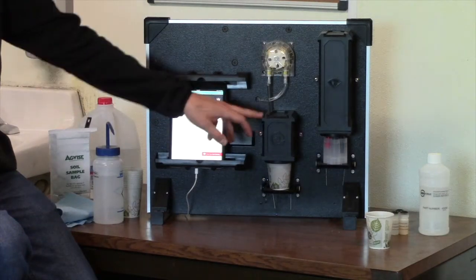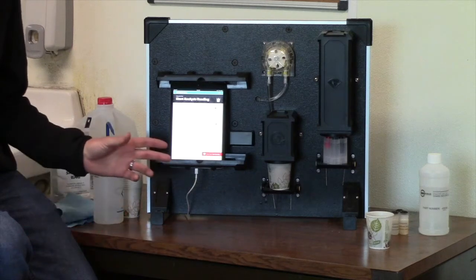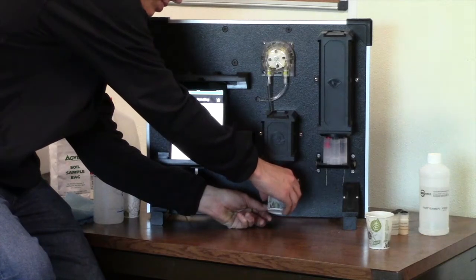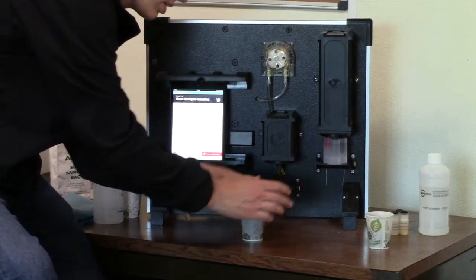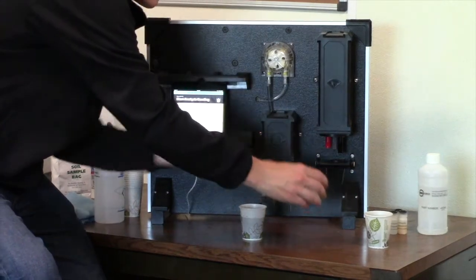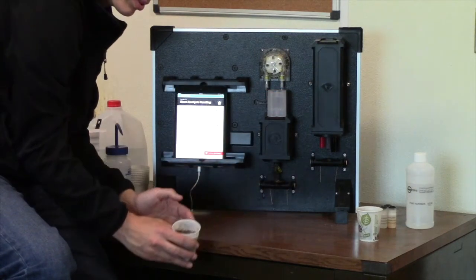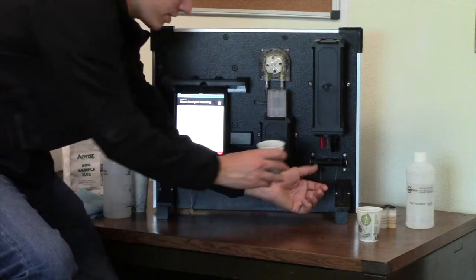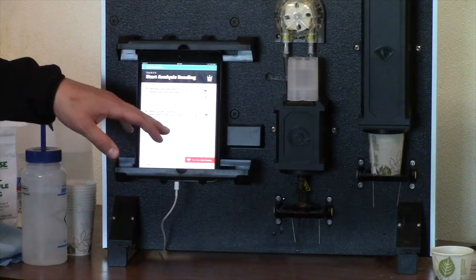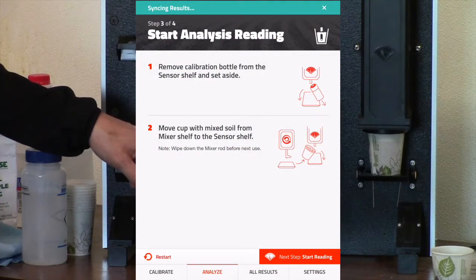After the mixing station is completed creating a soil slurry with the soil and water that was in the cup, you can then remove the sample from the mixing station, and also remove standard solution from the sensors. And then place the soil sample onto the sensor. After the sample is in place, you can come back to our 360 soil scan app and click the button in the bottom right corner that says Start Reading.